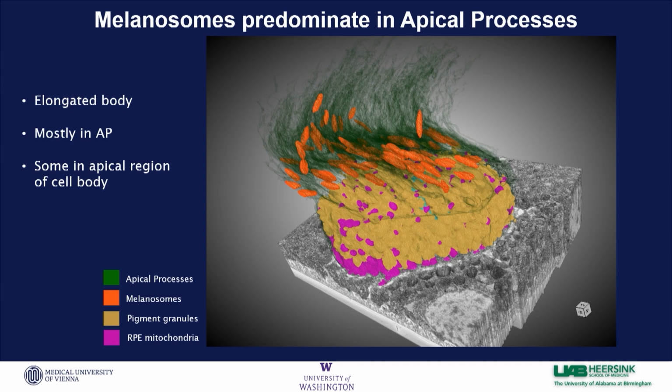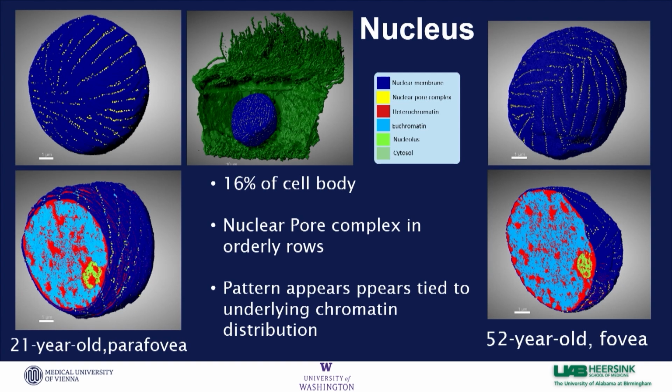When I came back in the morning, I was quite surprised to find that the nuclear pore complexes were aligned in nice orderly, parallel rows. As far as we can tell, that hasn't been described before. It's been reported that these pores cluster in regions like lumps, but nothing as distinct as this.